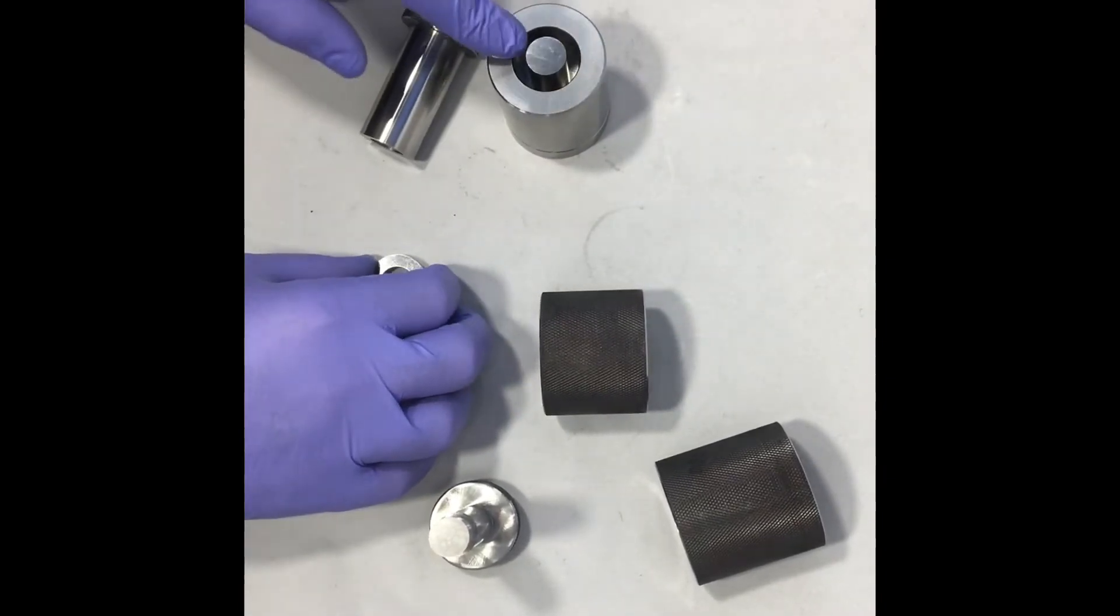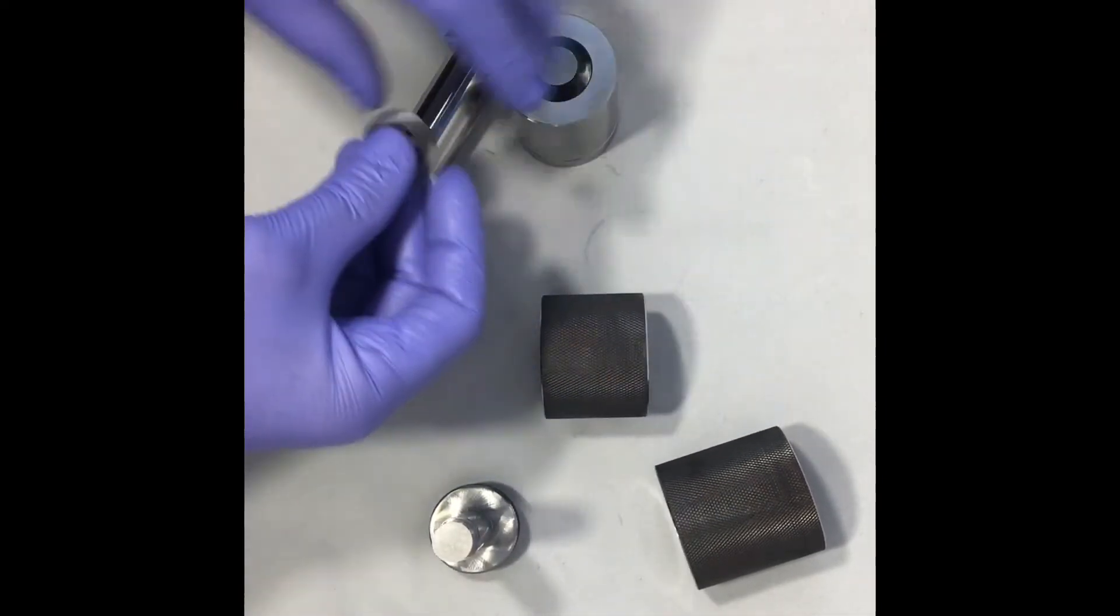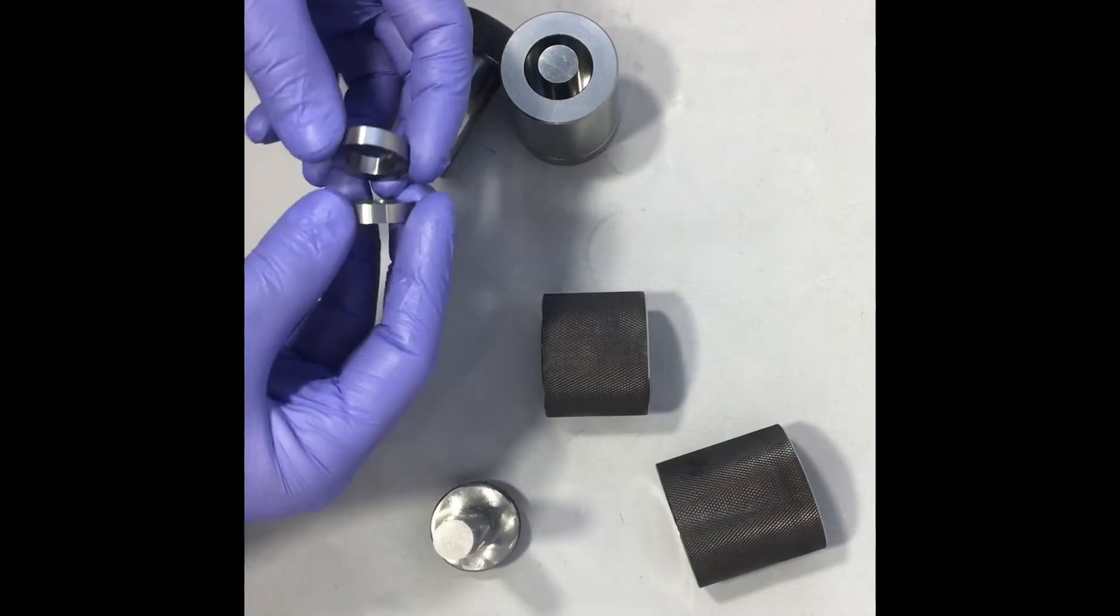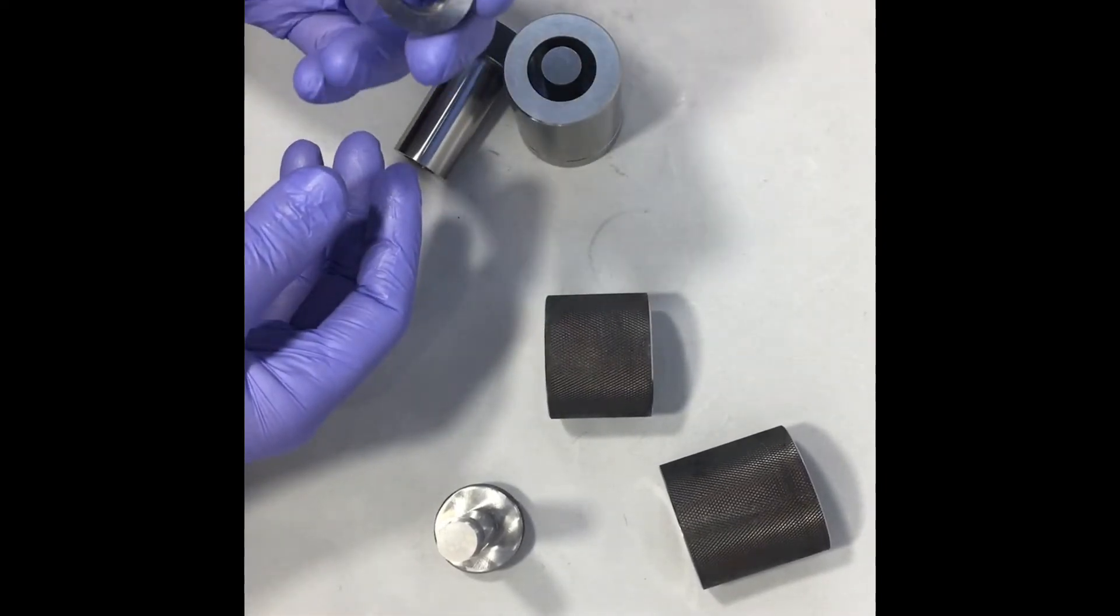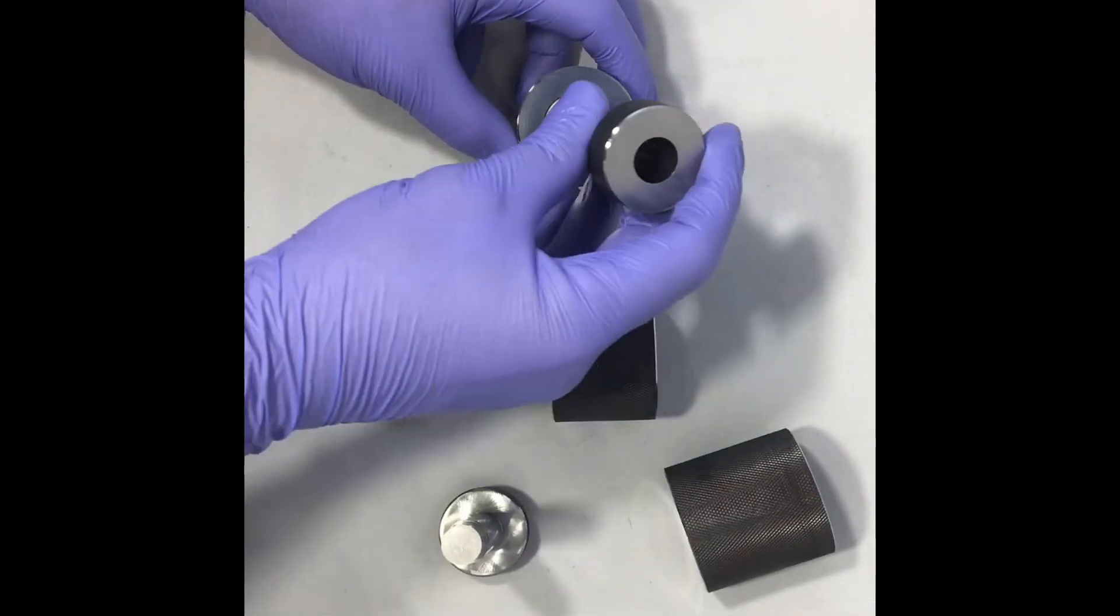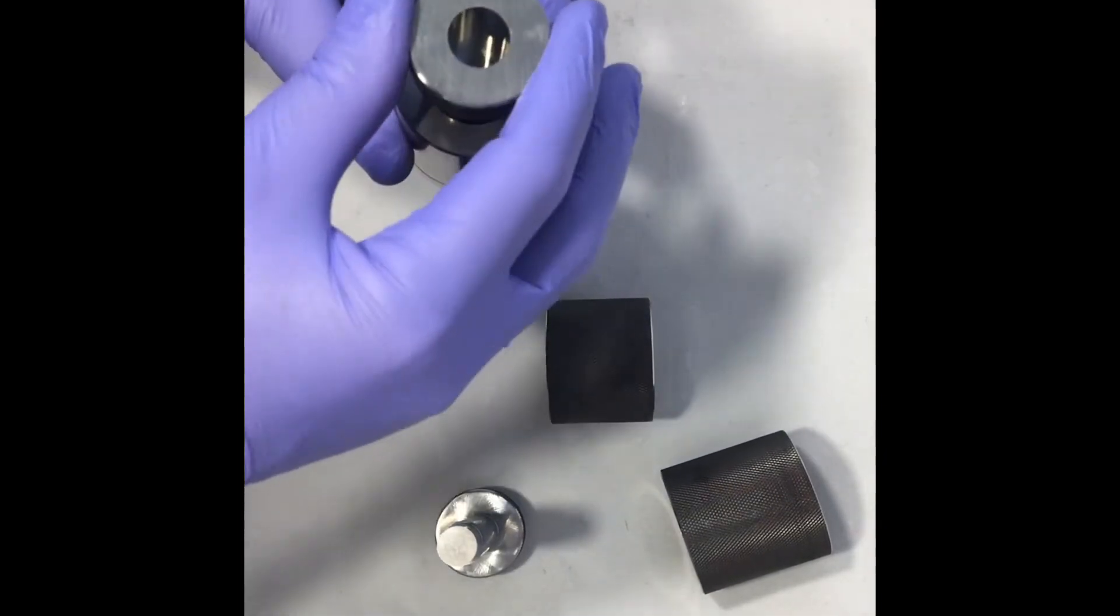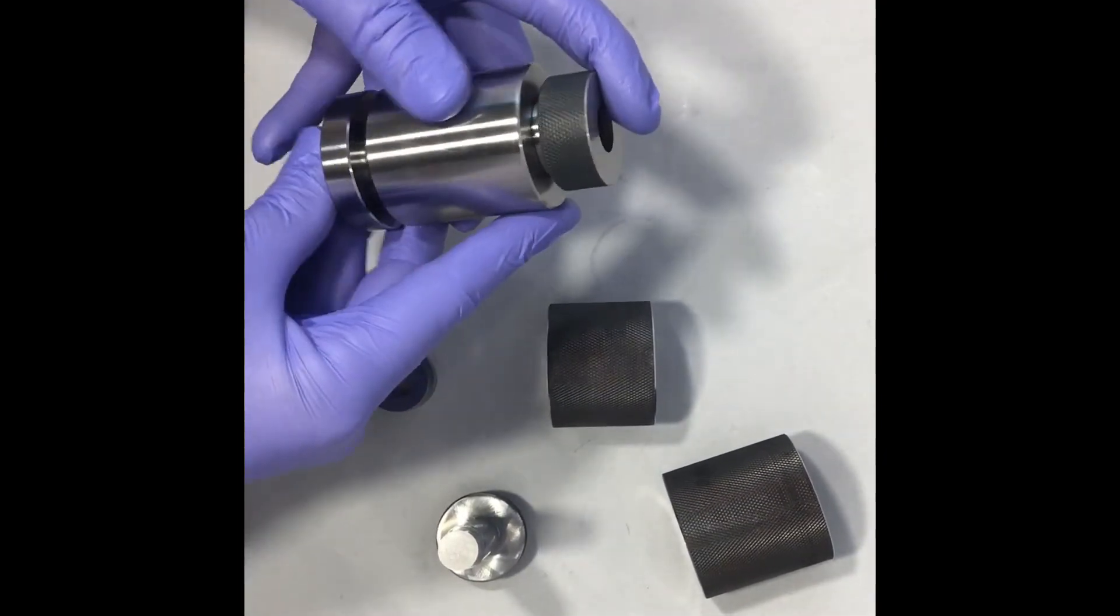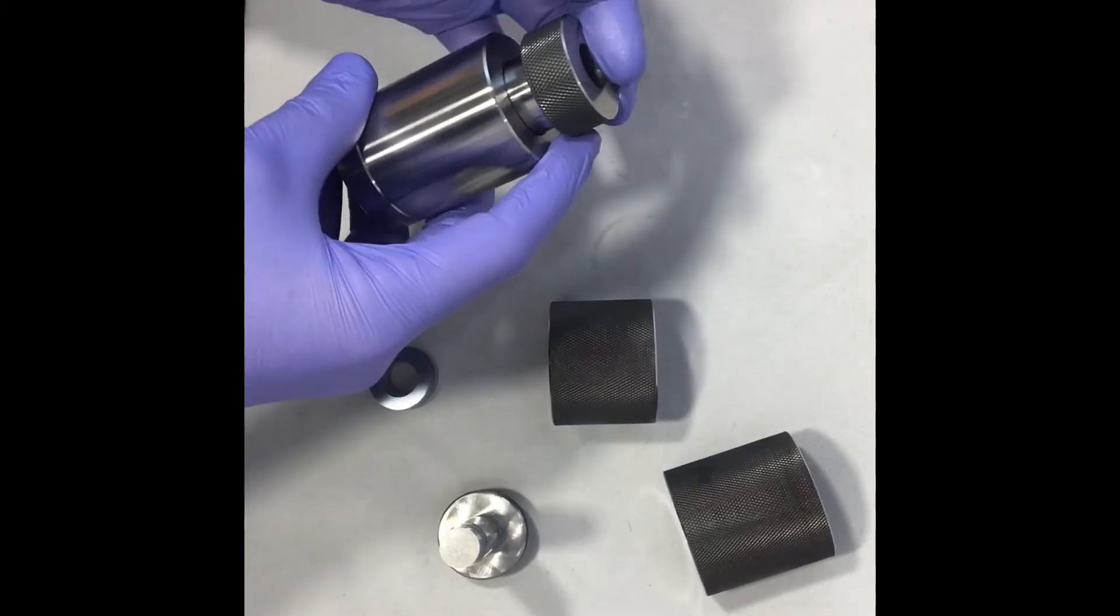You can either load your powder directly into here or if you're using the spacers this is when you put in your first spacer. What I'll do is I'll load this without adding the spacers here. So you put your powder in and then you put your plunger on top that fits over the pin like that and slides down. You can see how that all goes together there, slides through in and out just like that.